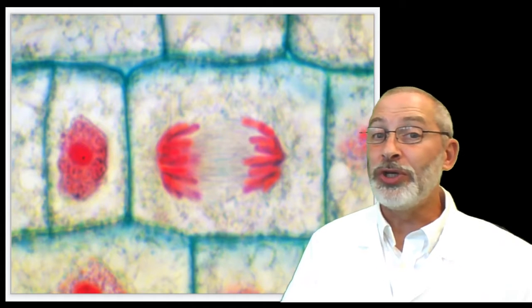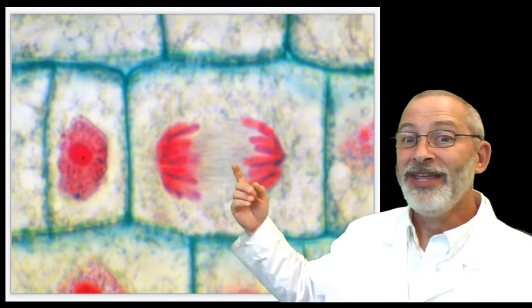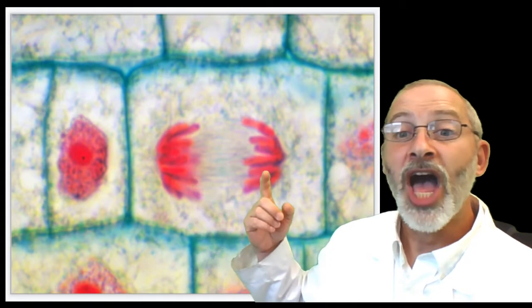What evidence or clue would you use to determine that? Hopefully you're talking about the appearance of these chromosomes moving away from one another, and they move away from one another during anaphase.